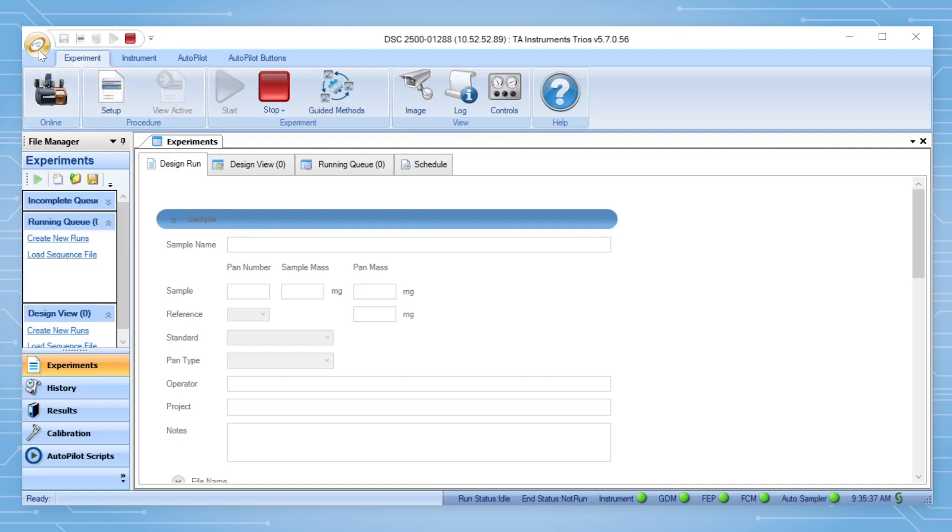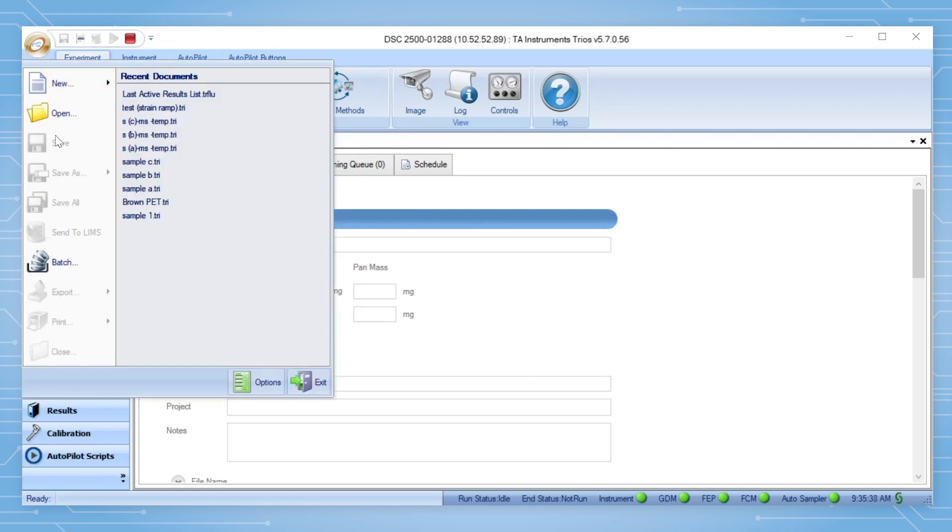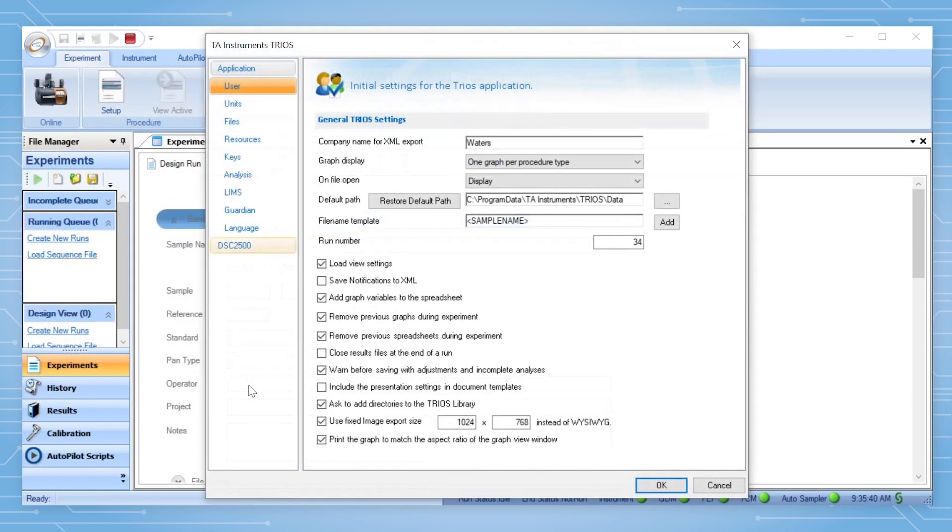In Trayus, click on the Trayus logo at the top left corner of the interface. Click Options, then click on the DSC model.